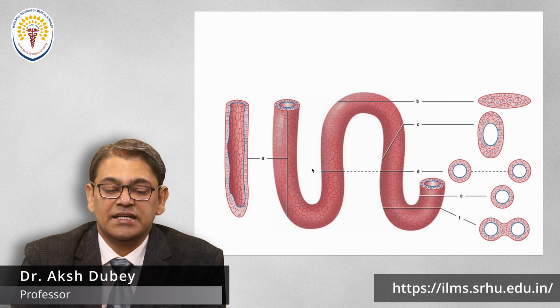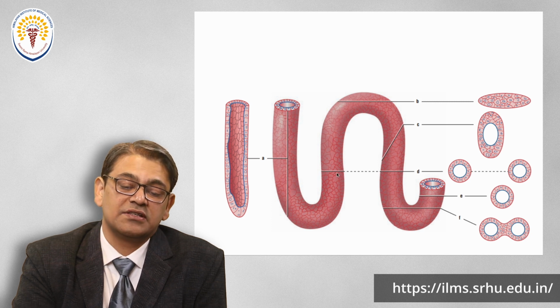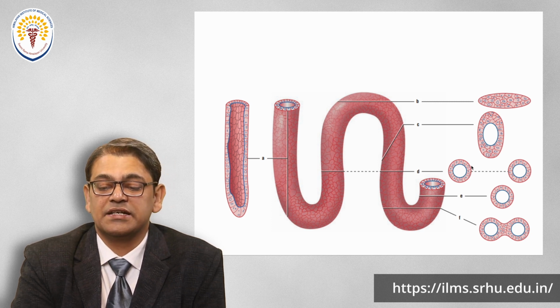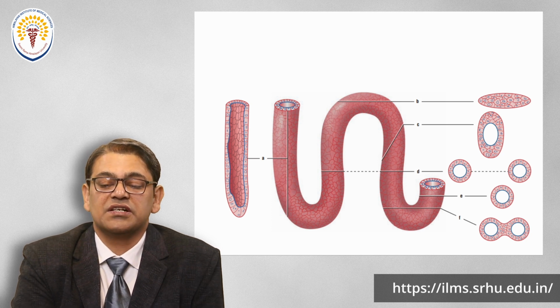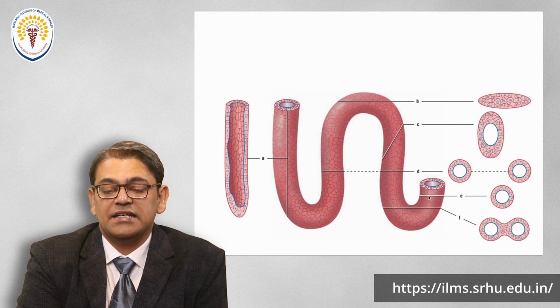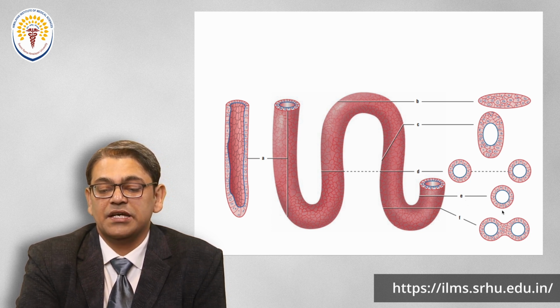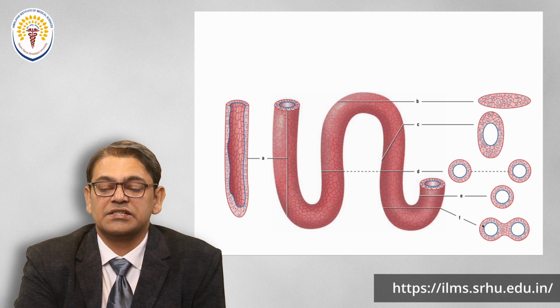Now in D, it takes two sections closely, one on this side, another on that side, and they appear in the histology slide as round hollow structures, right? Similarly, in E, if you take a section, you get a big structure with a lumen, and if you go slightly below that, where we see the U-shaped loop in the upper part, we see two lumens which are connected with each other by tissue.